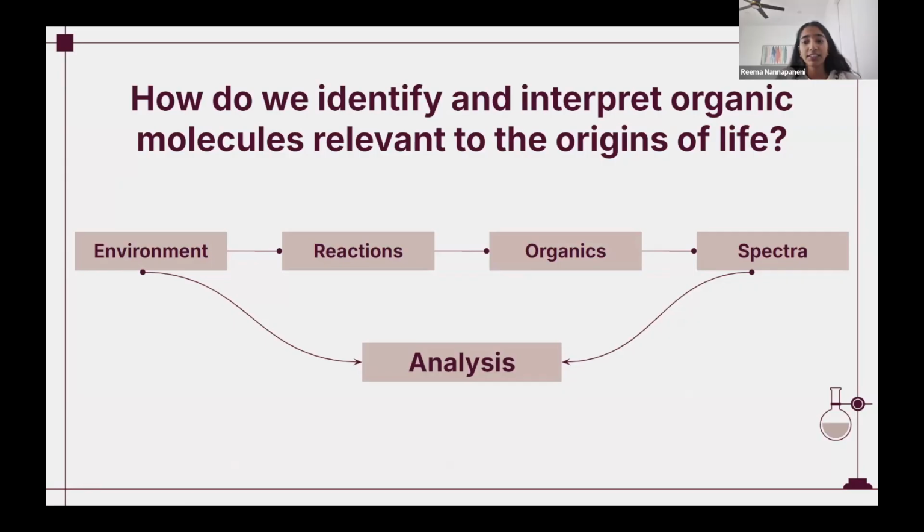In order to understand what molecules are present, we also need to understand the environmental conditions that produce them and the analytical conditions under which they were measured. This is where a database like the ASD becomes useful, because rather than treating the spectrum as an isolated piece of data, we can associate it with the chemical, environmental, and instrumental data to contextualize that measurement.